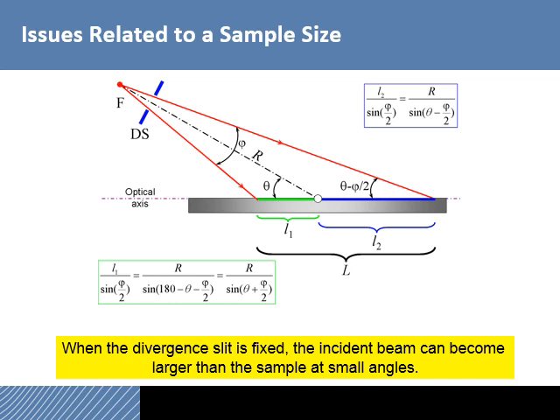You might want to ask the question, why do you not get diffraction from the sample holder? Most of the sample holders are made now of stainless steel, and that's because at those very low angles, the steel actually doesn't have any diffracting planes. As the angle goes up and is high enough, then the beam becomes small enough that it just hits the sample itself.